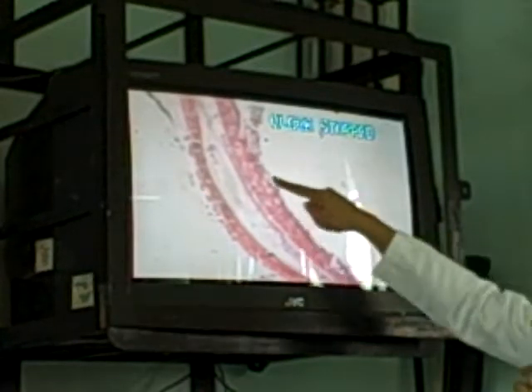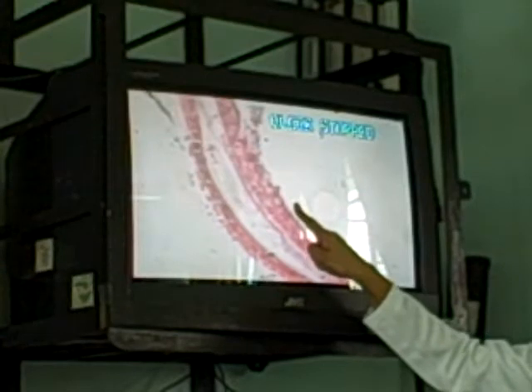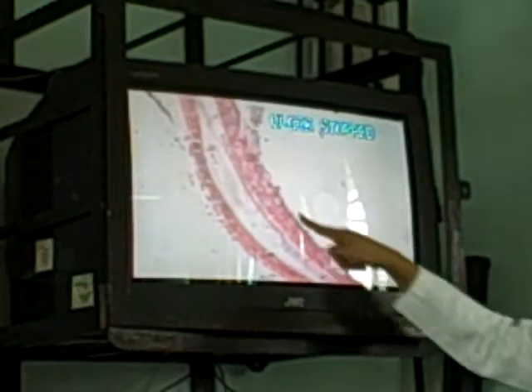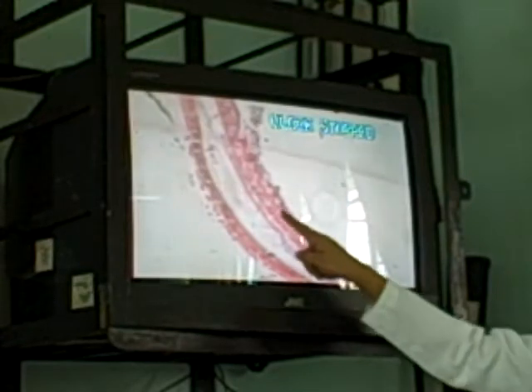This is a scanner view. Look, there's no extension or folds, no more folds like that. No more villi, no plica circularis. They are flat. So you have the lining epithelium on the surface, lamina propria occupied by the intestinal glands, because it's still a large intestine, still an intestine.